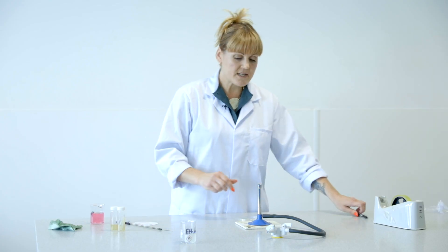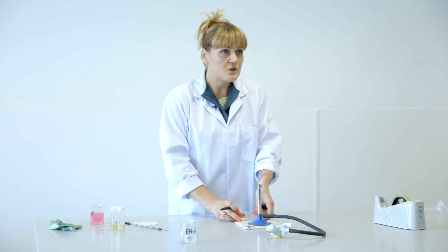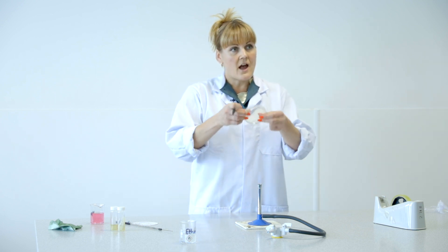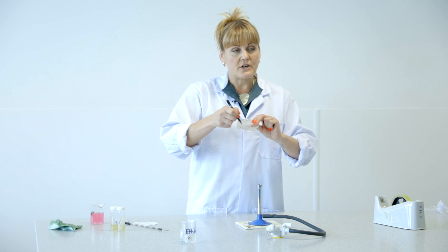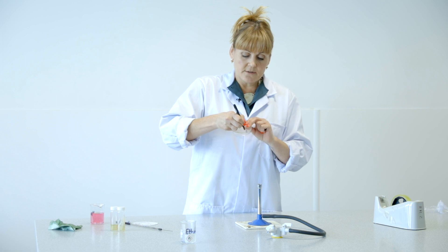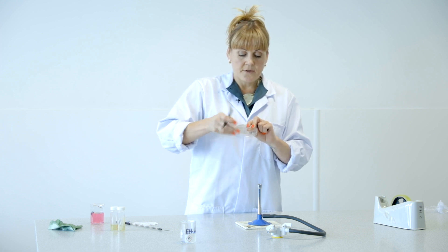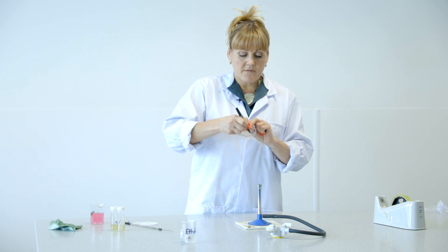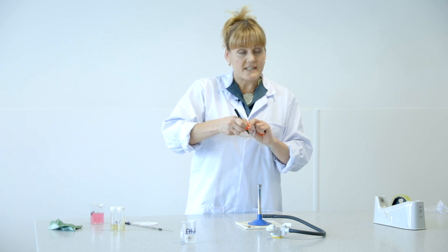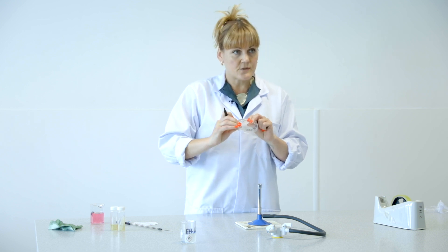Before we do that, you want to lift up your Petri dish very carefully and write around the circumference — so you don't obscure any growth — your initials, the date, and the name of the bacteria, which in this case is B. subtilis, so I'm going to put B. sub. That is written underneath.